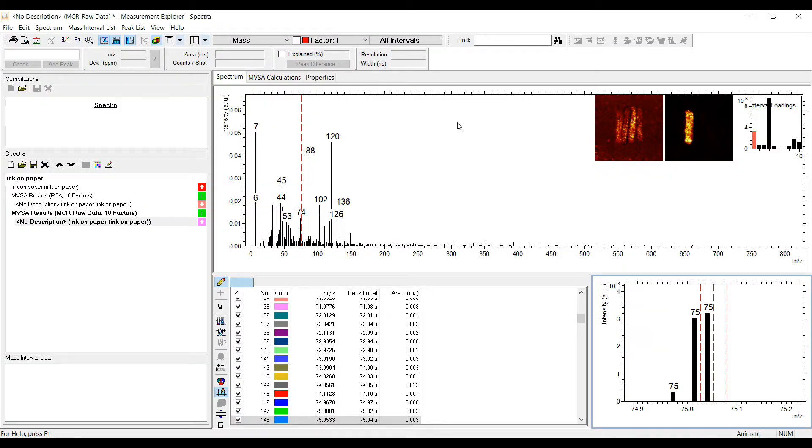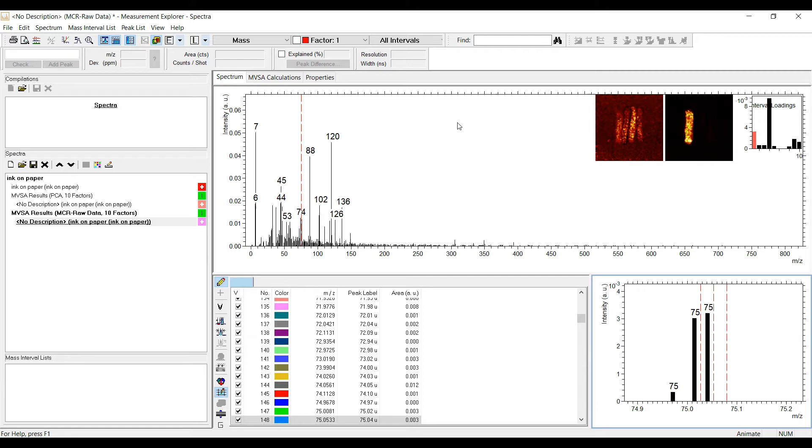The loading plots of the MVSA results will be displayed in the spectrum program. Loadings describe how the variables, which means the mass intervals, relate to the factors. The loadings show which mass intervals are responsible for the differences seen in the score images. High loading values indicate that the mass interval strongly influences the component. Loadings close to zero indicate that the variable has a weak influence to the component.